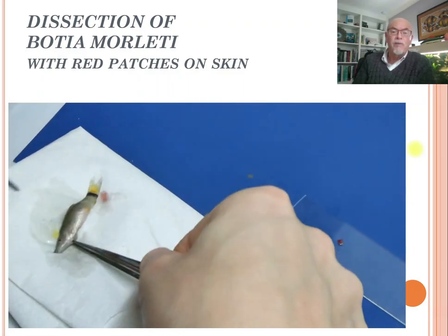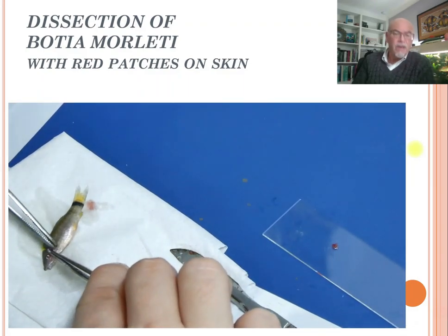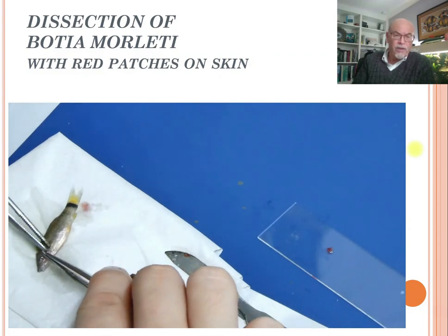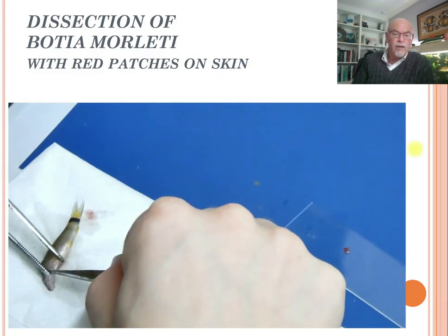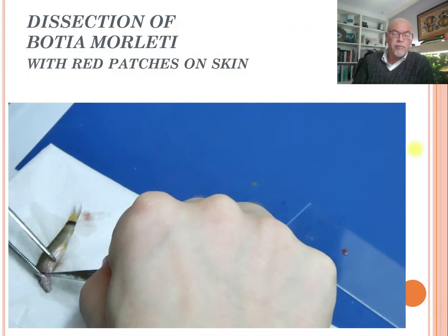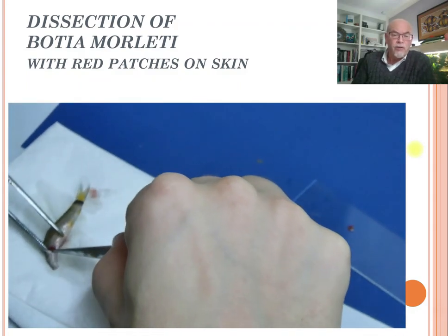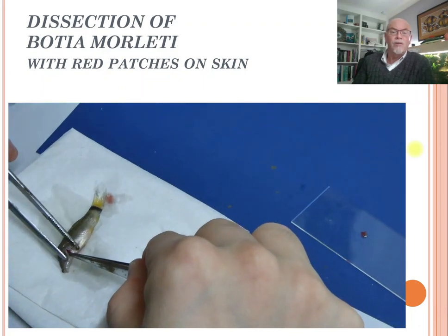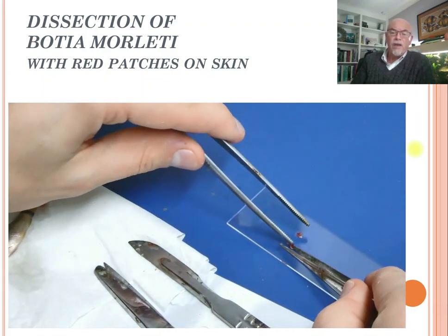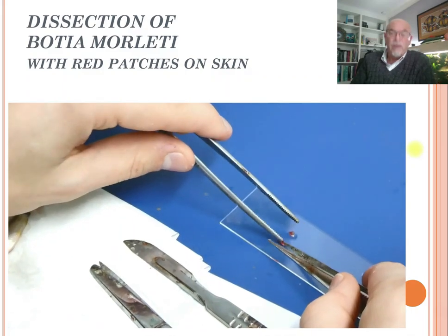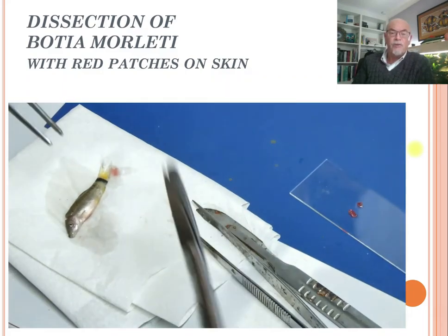That means taking out the organs we want to examine with the help of a microscope. Here he has taken out the gills and the gill tissues, just to make sure he has enough material to check for the possible diseases or pathology on the organs. It takes altogether just a few minutes.